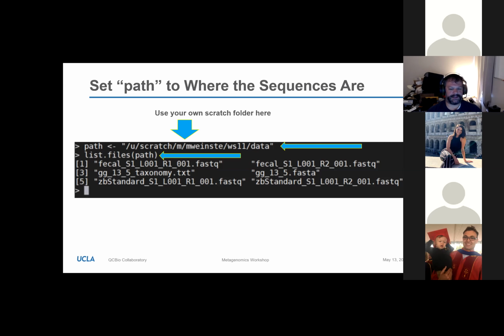Unlike a fecal sample, which is going to have a broad array of taxa and be a very complex microbial sample, the Zymo Biomics standard is 8 different bacteria, and they're all basically reference strains. So that one's a super simple standard. The cool thing about it is it's known strains present in known relative abundances.